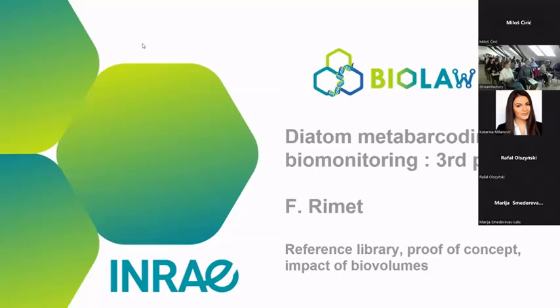So hello for this second day. This morning we're going to talk again about Diatom metabarcoding. There will be, let's say, the third part. We will talk about reference libraries.